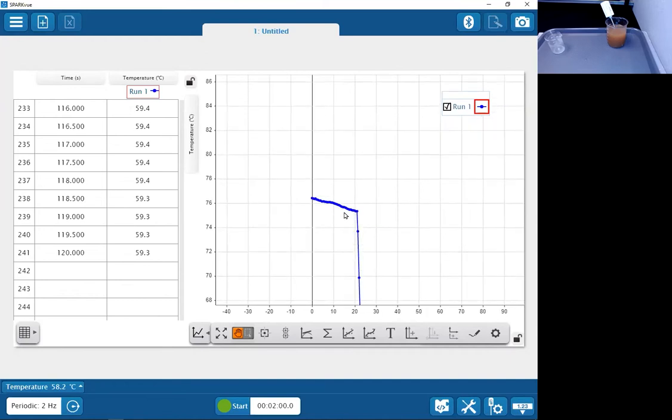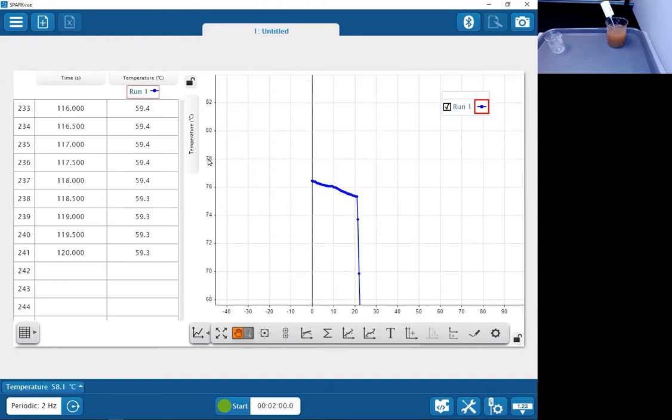And if I want to zoom in, I can take my regular cursor or finger if you're on a touch screen, and I can click and drag on the numbers on the x-axis or on the y-axis.